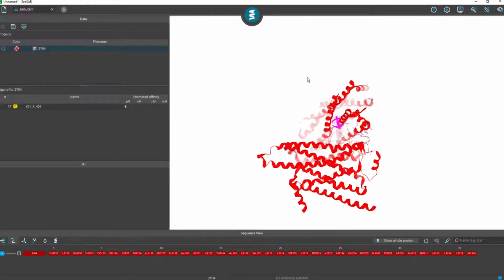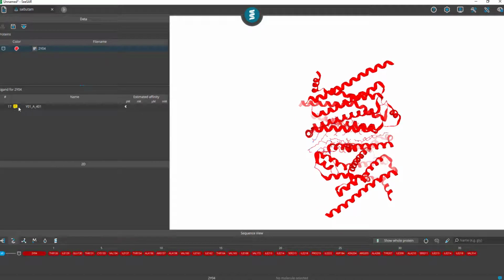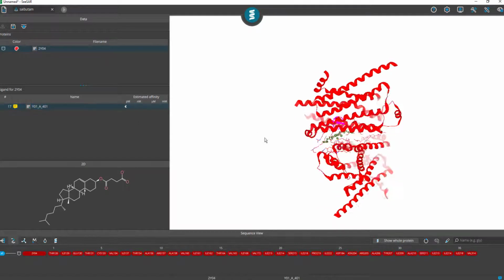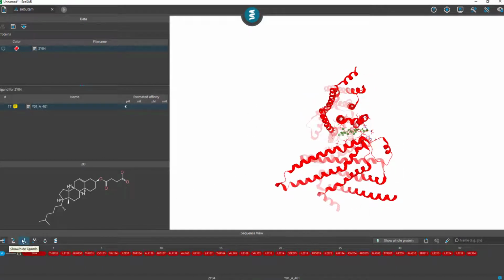So in a normal workflow, you'd like to start with just defining your binding site, and then you'd actually want to clean all of the other hetero groups besides your ligand of interest that is here, and this is done very easily. So we see the options over here. There are multiple tabs. First, that says Show and Hide Residues. We know that if we click on this once, everything disappears. Put it back on. We see there's Show Hide Ligands. Let's see what's in there.